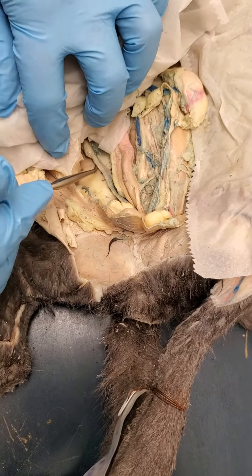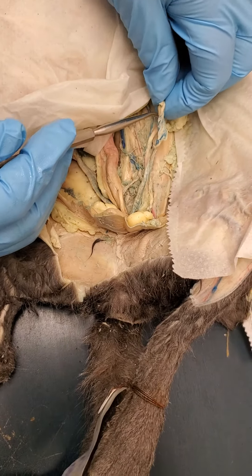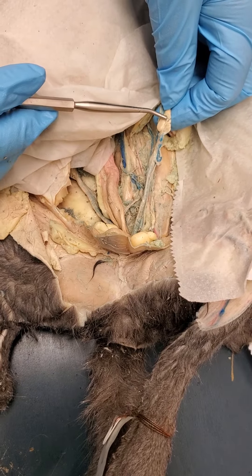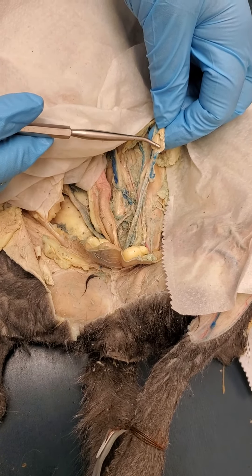If you follow the uterine horn to the end, you will see the ovary right here. And then this right in here would just be the uterine tube — it's very, very short, obviously.